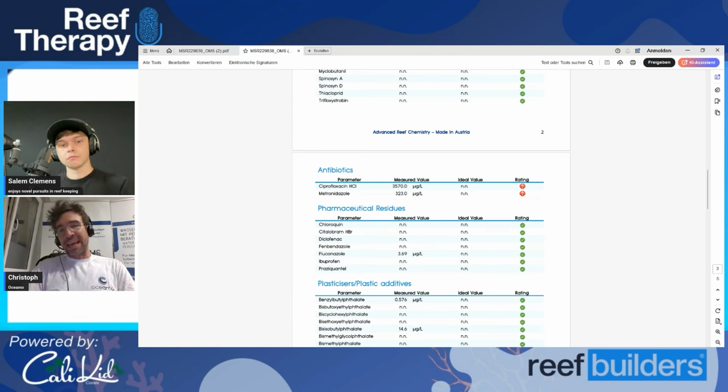But having the UVA from the lighting, I mean, this is really low intensity, and also the water absorbs to some point. So I wouldn't expect a lot of degradation because of the normal lighting. But those are really things where you can set up nice studies or mini studies to have an experiment with 10, 20 samples, taken in a very wise way, to find out about those effects.